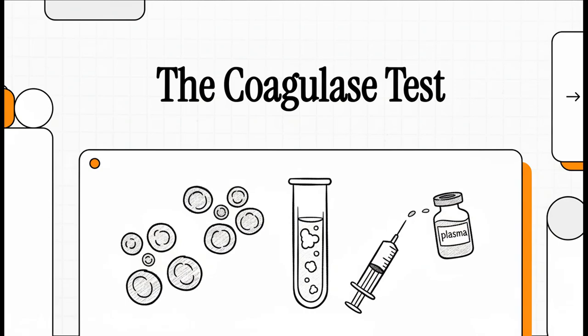In the world of microbiology, sometimes it's the simplest tests that have the biggest impact. Today, we're going to break down one of those cornerstones, the Coagulase test. This is pretty much our #1 tool for unmasking one of the most important bacterial pathogens out there, Staphylococcus aureus.